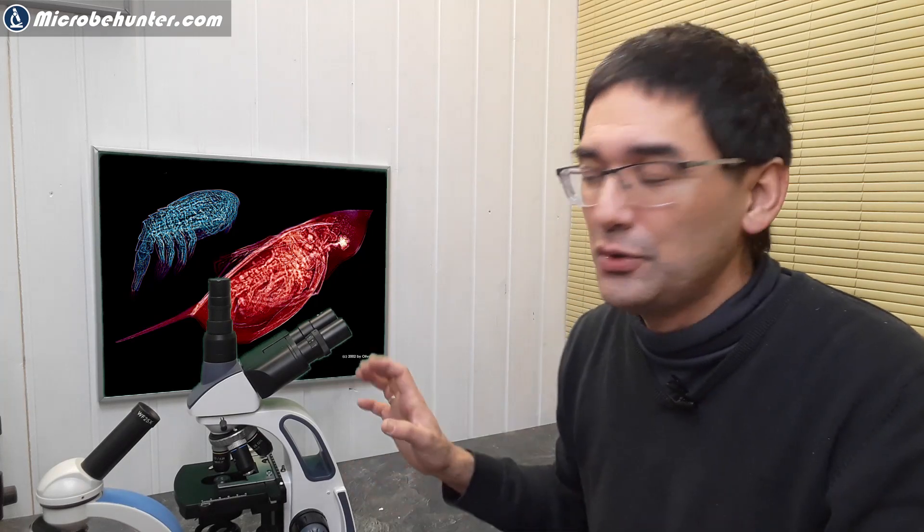So you see, there is not in that sense, there is really not so much of a difference. But I think the main difference is that if you are actually sitting behind the microscope for a long time, it is simply much more comfortable and convenient to use a larger microscope. Because it is larger, it's more stable to use. You've got a mechanical stage here that allows you to move the specimen around. So there are a whole bunch of several features or several things that kind of add up, that kind of add to the whole experience of microscopy. And it is not only the image alone, but it's also kind of the context a little bit that also plays a role.